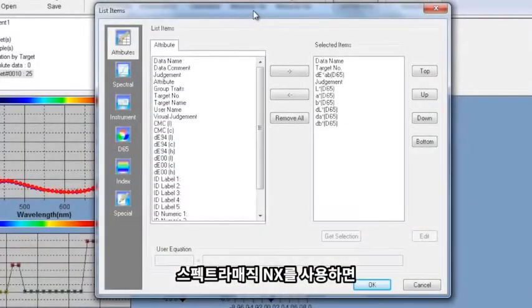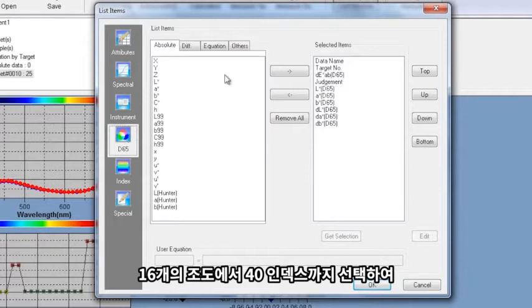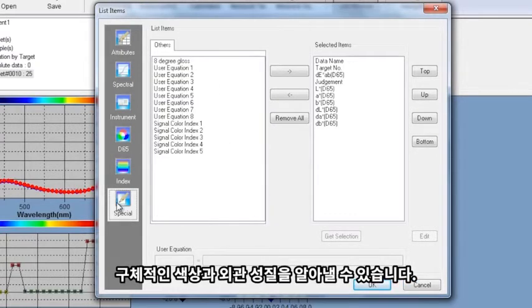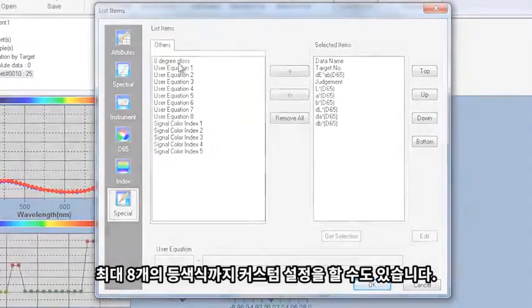With SpectraMagic NX, you can measure samples in any of eight universally accepted color spaces. Select from 16 illuminants and up to 40 indices to determine specific color and appearance properties, such as strength, brightness, haze, yellowness, opacity, and whiteness. You can even configure up to eight customized color equations.